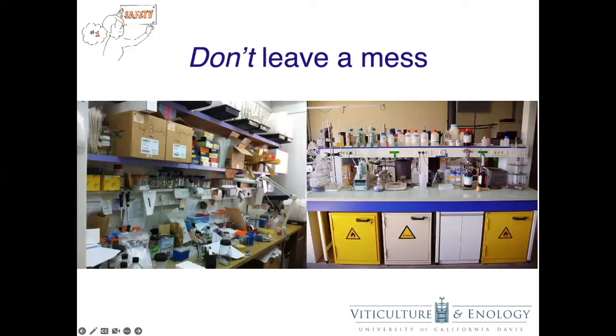Don't leave your lab a mess. Each lab should be clean, organized, and free of clutter. All chemicals and solutions should be properly labeled and stored. A clean and organized lab helps prevent accidents.